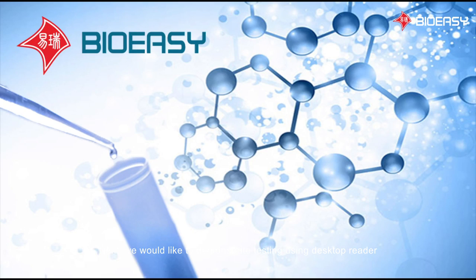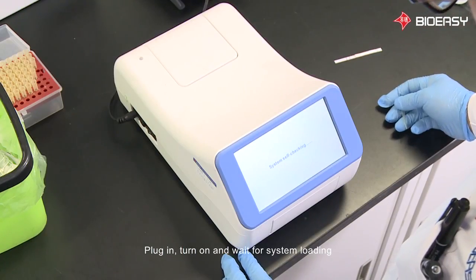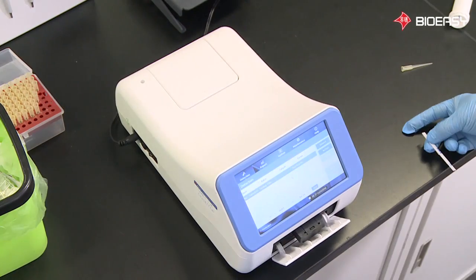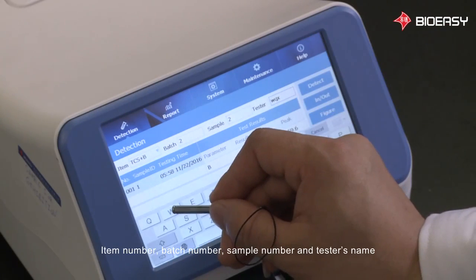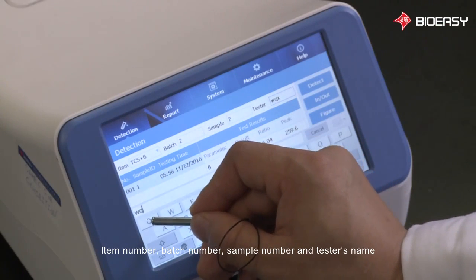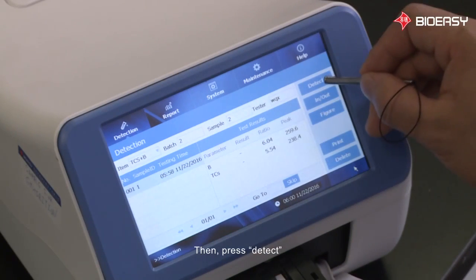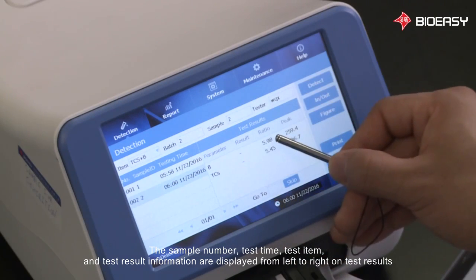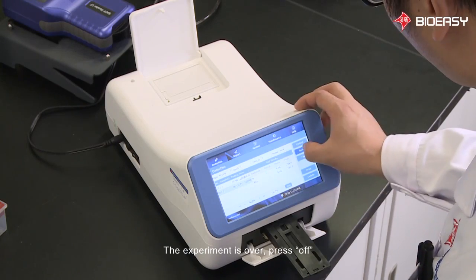Next, we would like to demonstrate testing using the desktop reader. Plug in, turn on, and wait for system loading. Place the test strip and set the parameters: item number, batch number, sample number, and tester's name. Then press Detect. The sample number, test time, test item, and test result information are displayed from left to right on the test results page. Press Print for printing the results. The experiment is over. Press Off.